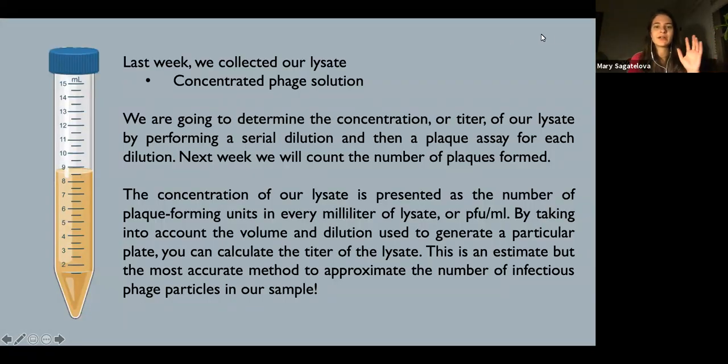So briefly, let's talk about last week. We collected our lysates last week. Again, lysates are a concentrated phage solution. So we are going to be using this for the rest of the semester moving forward. Like I mentioned, every week for the last 3 weeks, we want to be able to characterize our phage.